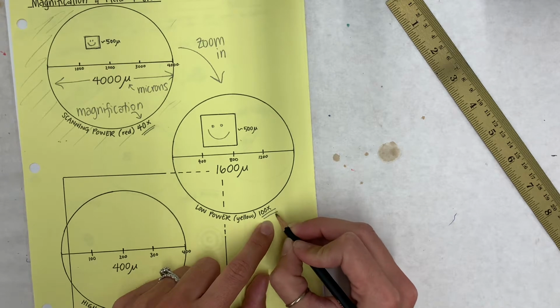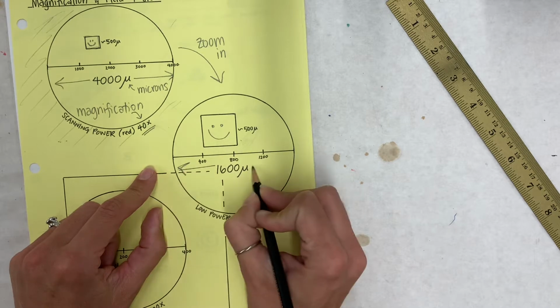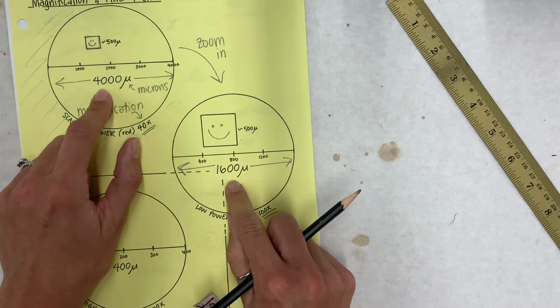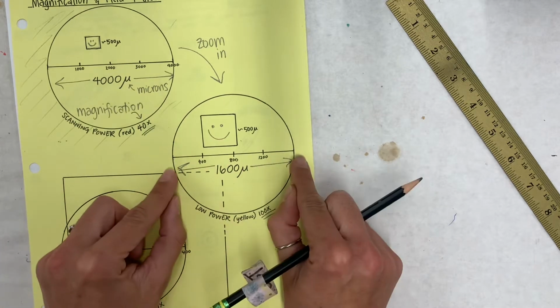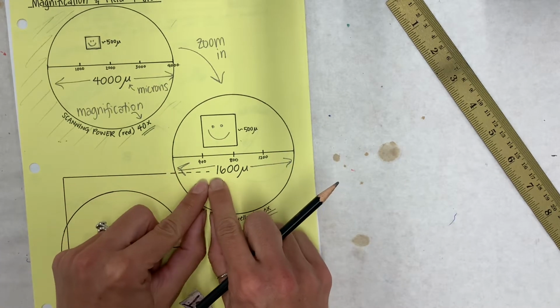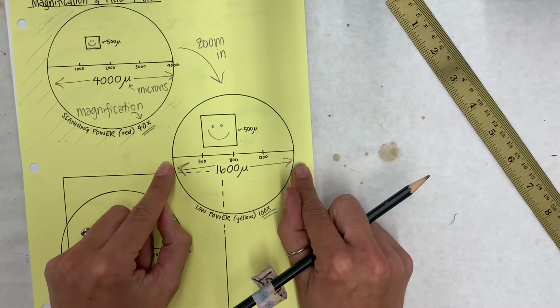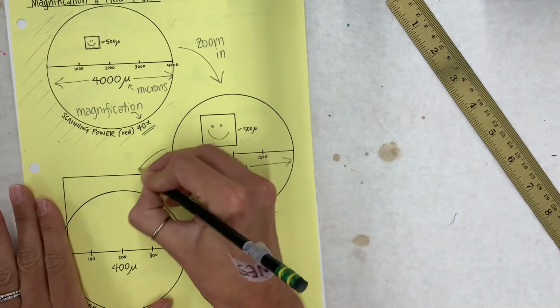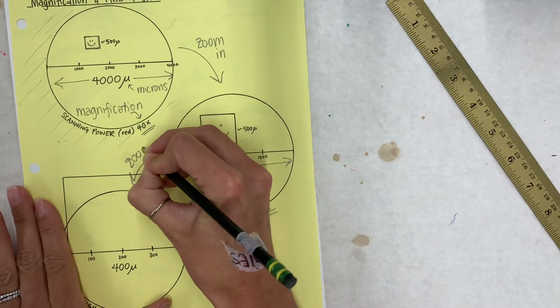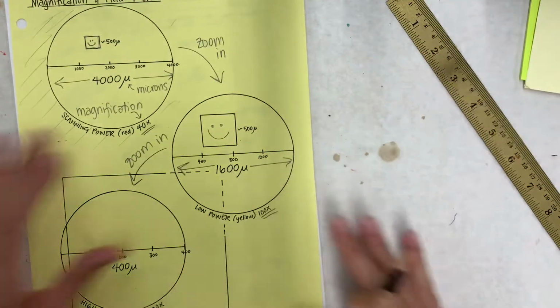That's the full magnification. Now our distance across our field of view has changed. Take a look at how these numbers have changed. Now that we're more zoomed in, this distance across is smaller. We now only have 1,600 microns across our field of view. We can zoom in one more time, and we can view our specimen on high power.